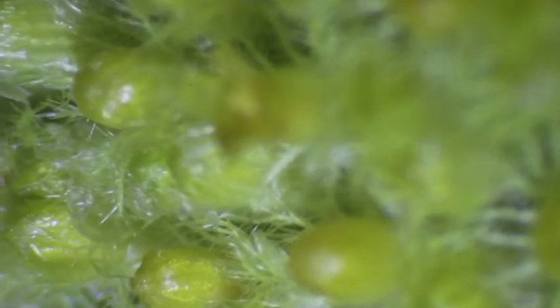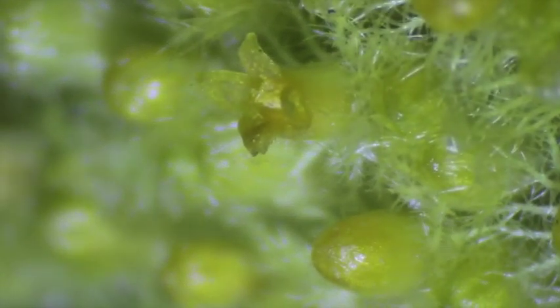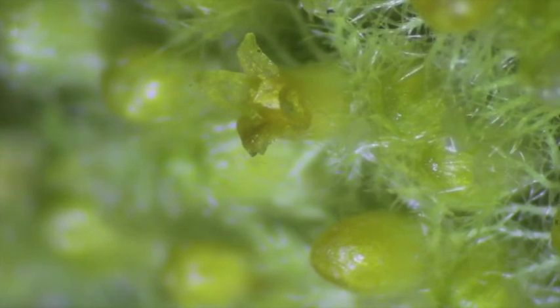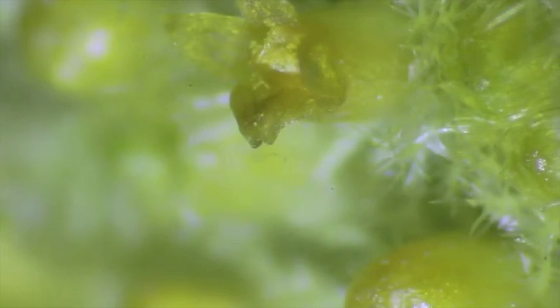So I thought I'd just get in here and focus on one of these little itty bitty guys being a flower, just to see what we can see in here. Looks like it has pollen all over it, so we can see the pollen everywhere on the outside of that flower there. See if I can move it and get it right in the center of the field of view here. But look at all that pollen. So any pollinator gets on it at all, it's going to get a lot of pollen on it.